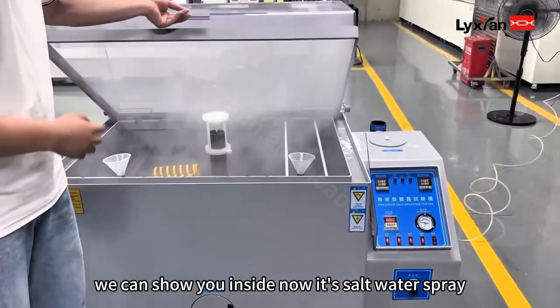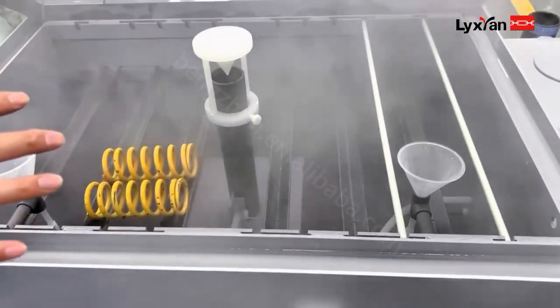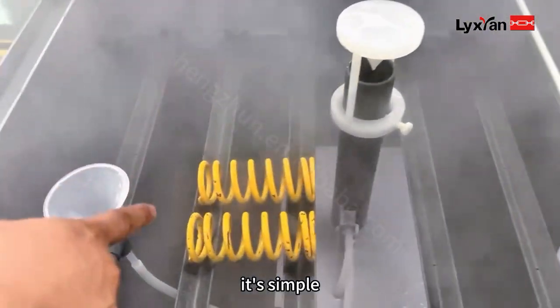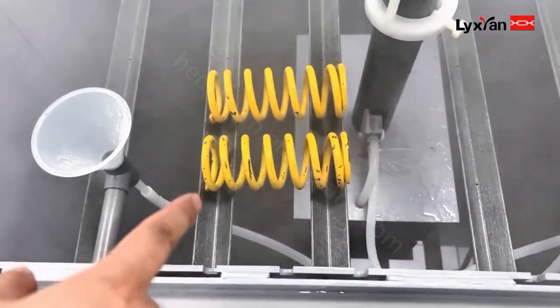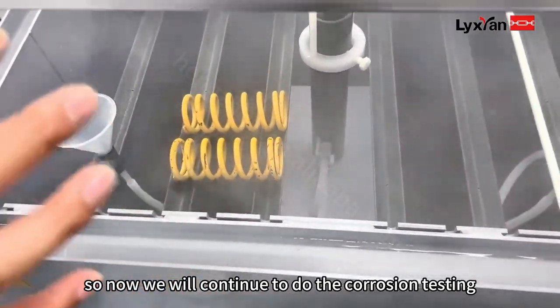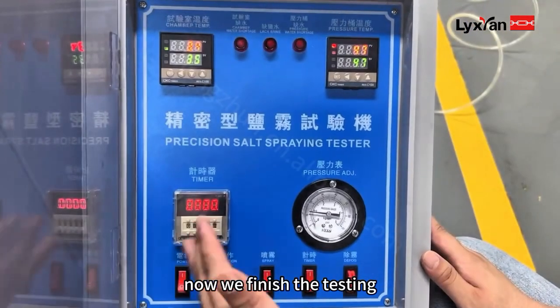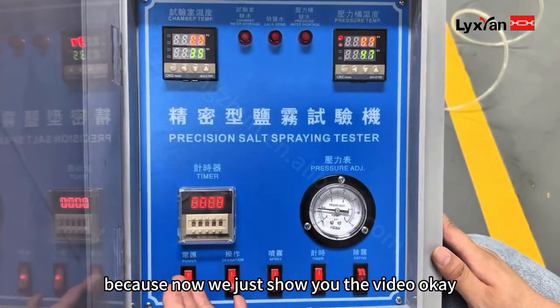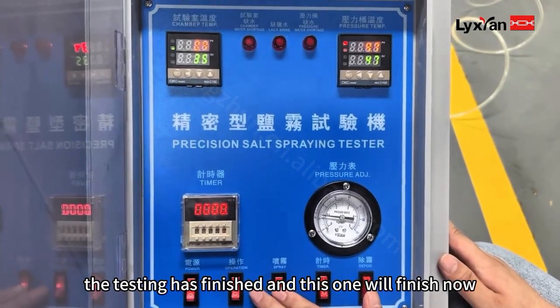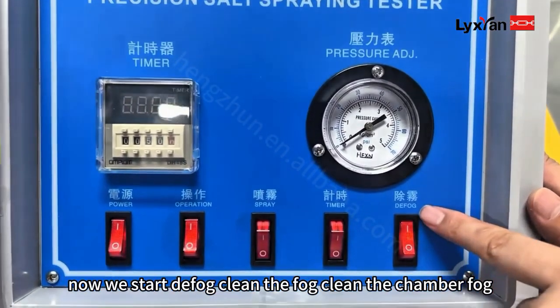I can show the inside. Now there is salt water spray active inside. We will continue to run the corrosion testing for 100 hours. Now once testing is finished, this cycle will complete.